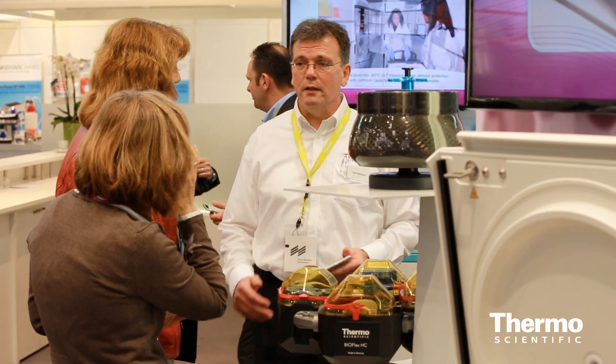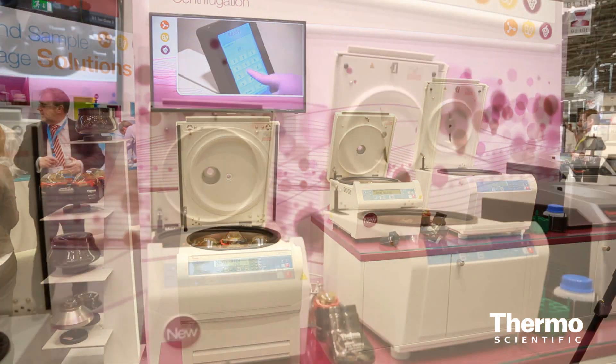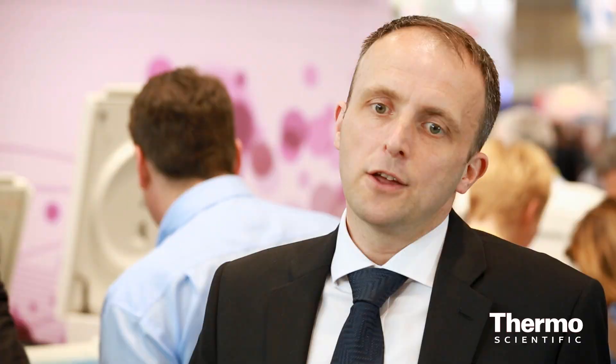Another new product that we're launching here is the Heraeus Megafuge 8 and the Sorvall ST8. These are great new small bench centrifuges — a real universal centrifuge that fits in the clinical labs, research labs, and for customers that just want to do small molecular work.